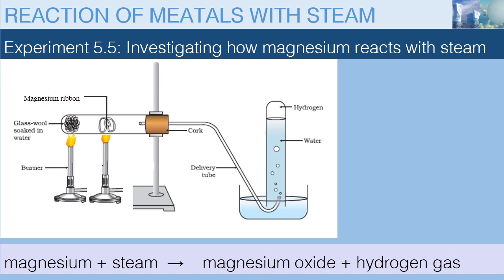Now, after we assure that all the oxygen is driven out of the test tube, we will start to heat the magnesium, and it will burn in a bright white flame, forming a white powder. The gas that is produced can be collected by the over-water method.